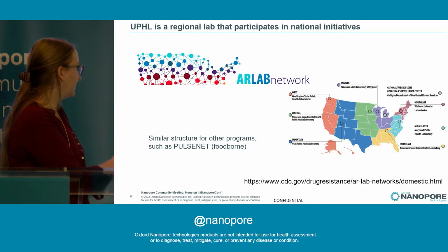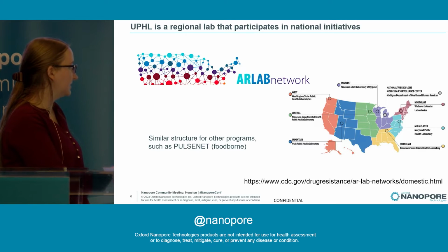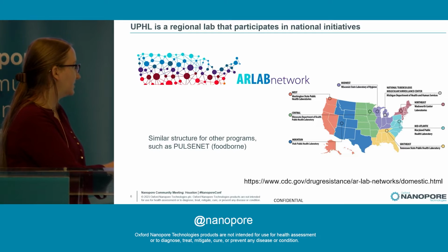There's also a similar structure for other organisms such as PulseNet, which we've also done long-read sequencing for. So when I talk about the organisms that we've sequenced for antibiotic resistance, most of them have come from this region of the United States, although we do have some isolates that were shared with us from other regions.